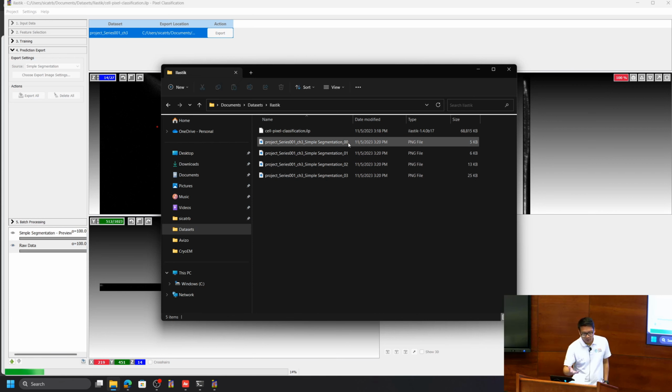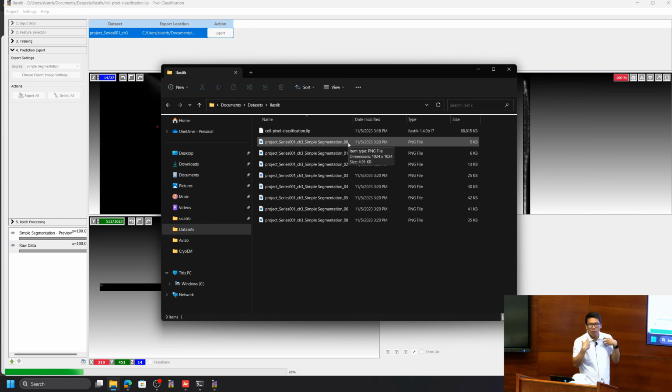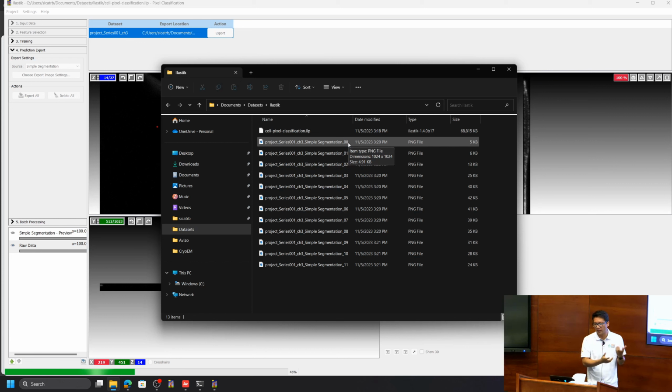So while this is computing, this is very similar to, well, the difference here is that you provide the random forest algorithm the input for training. Okay, so you have more freedom and more control, but it requires more effort, of course.